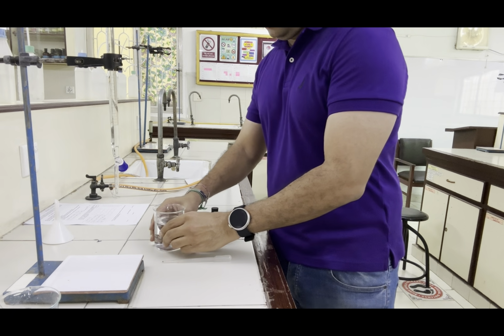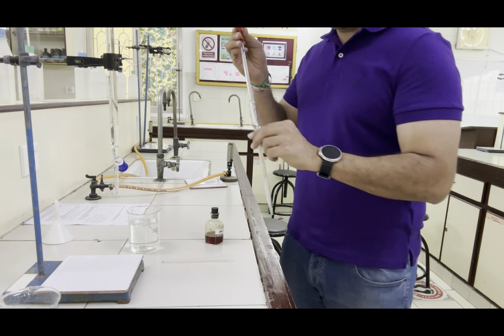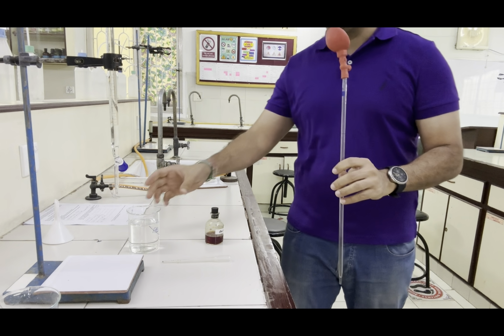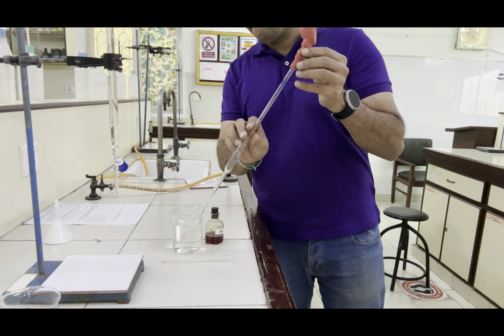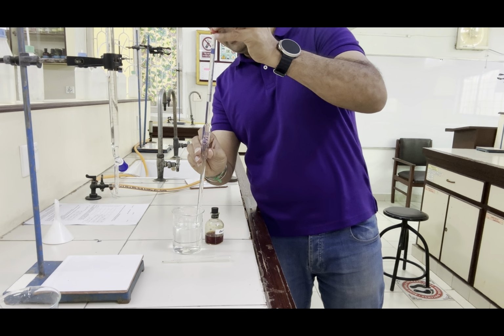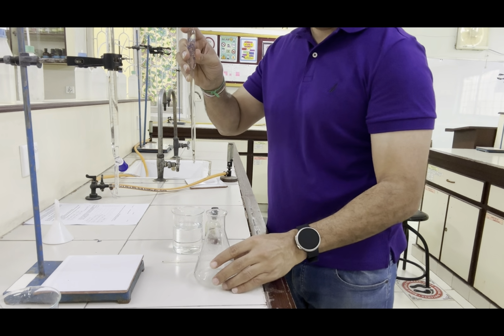And now I will take 25 centimeter cube of Fa2 again using this pipette filler. We will fill this pipette. Here is our Fa2. Up till the mark again, we will take it and we will pour it into this washed conical flask.